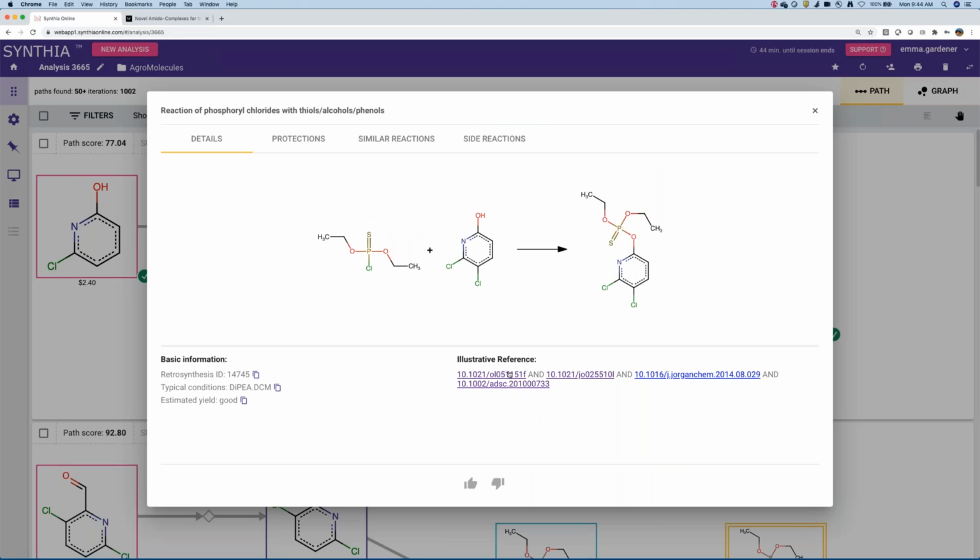You can see there's sometimes a few different options. A lot of times they'll try to choose a seminal paper for that kind of chemistry. Sometimes it's the use of that reaction in a total synthesis, or a methods paper where there's a significant substrate scope. So you do have an idea of the literature precedent for that chemistry.